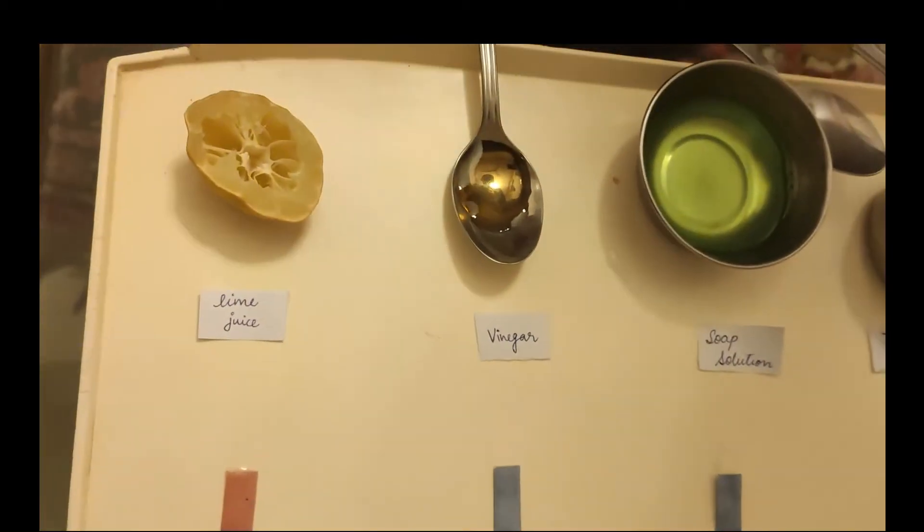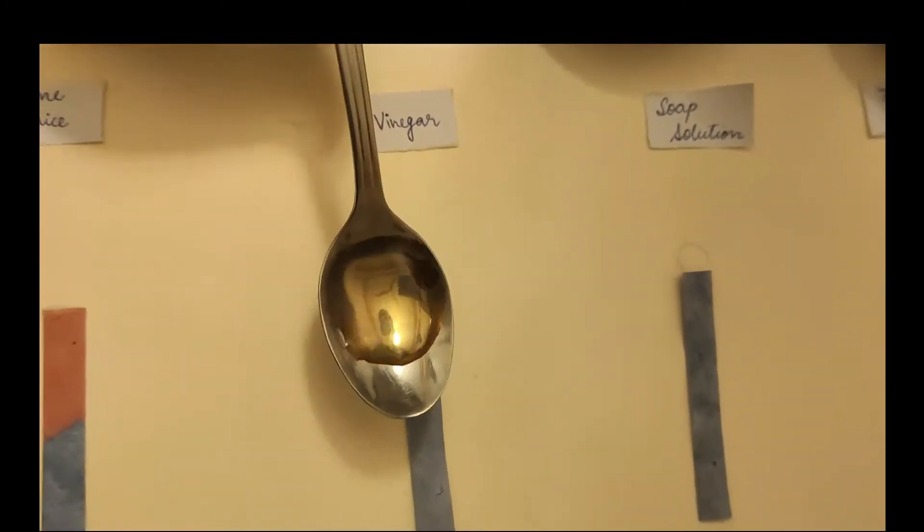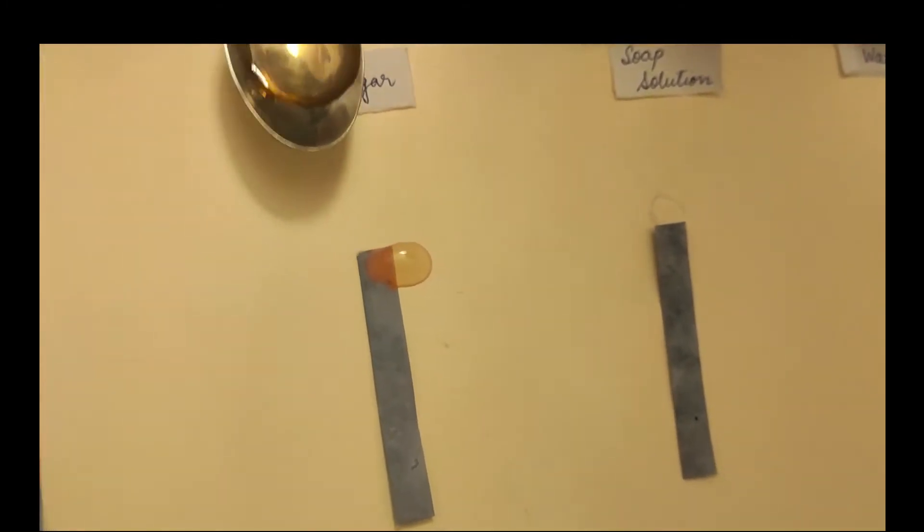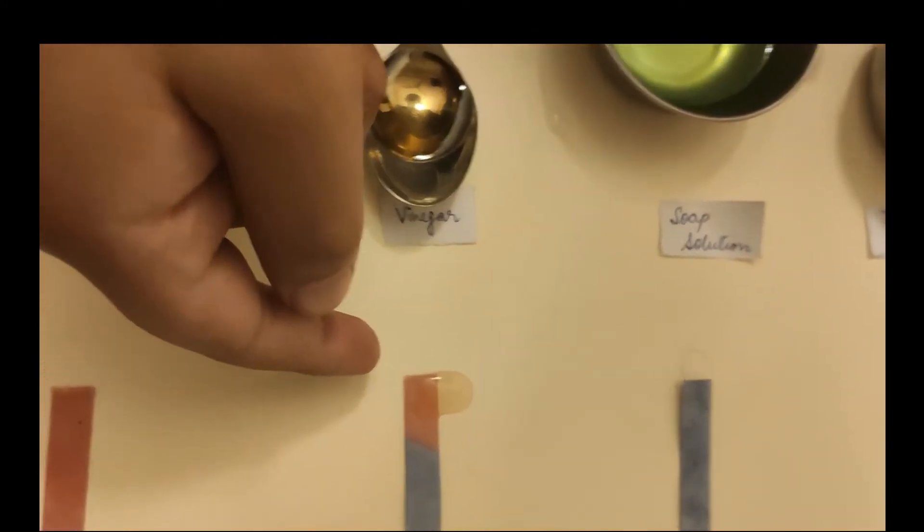Now, let's see about the vinegar. Just gently. Here we see again, that the litmus paper turned red.